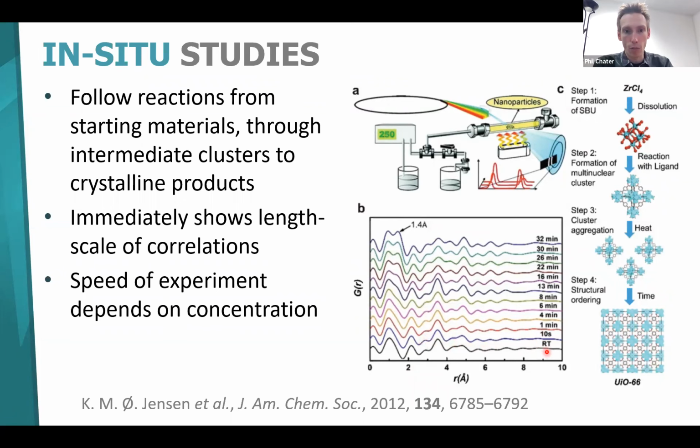So here at room temperature, we see that we have no correlations beyond around 6 angstroms. And as the reaction goes on, we see significantly stronger correlations at higher and higher R, up to the point that we see after 32 minutes, this more crystalline region here.